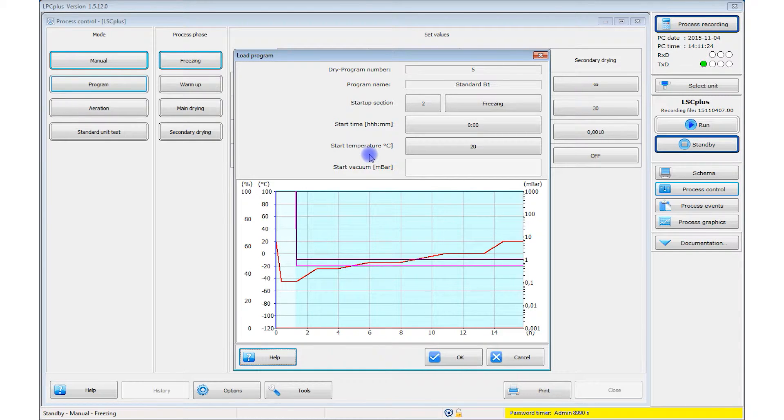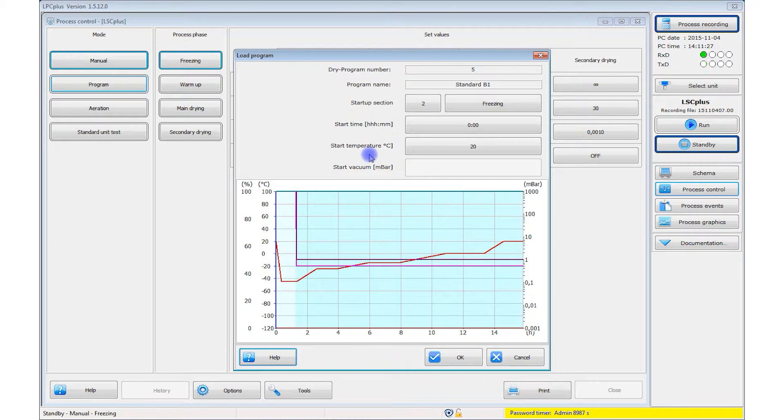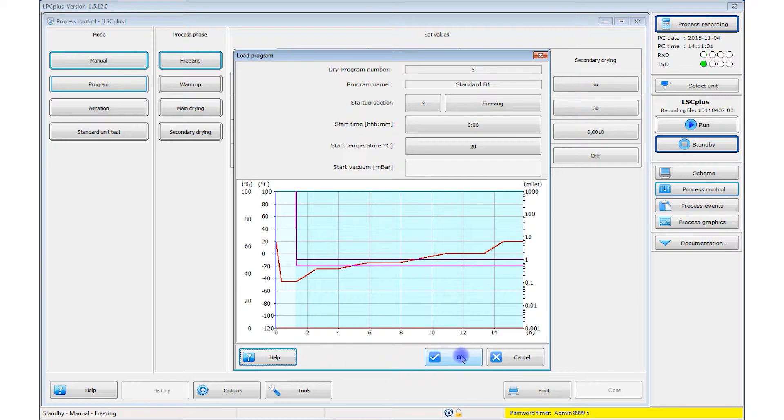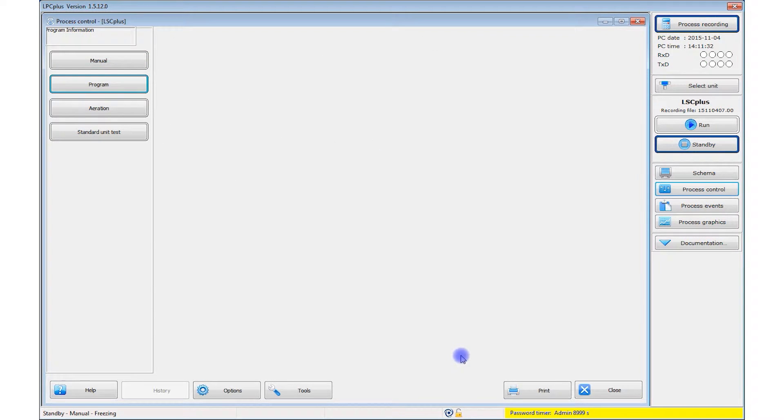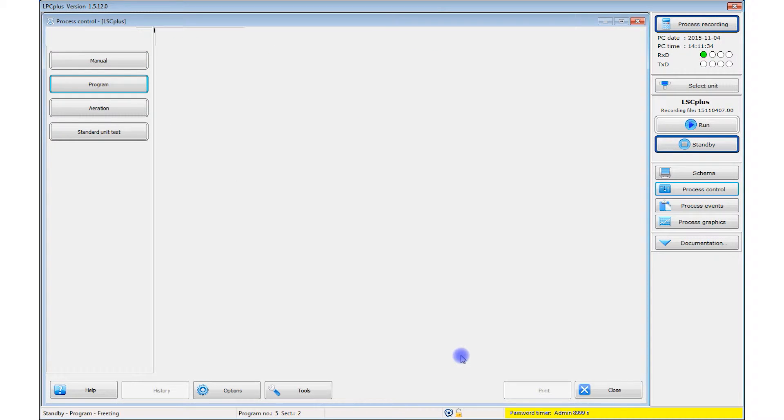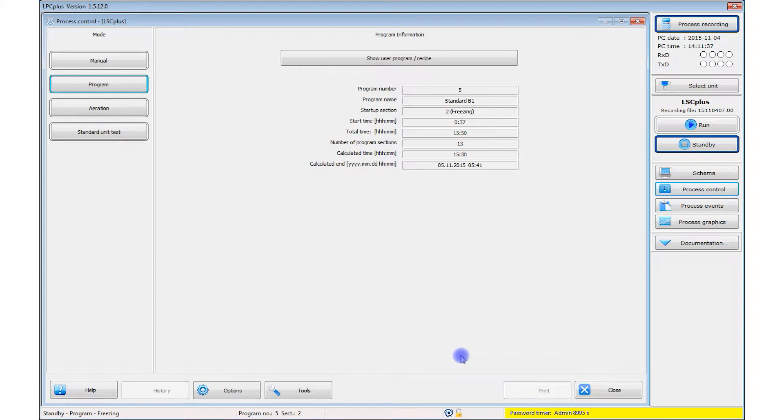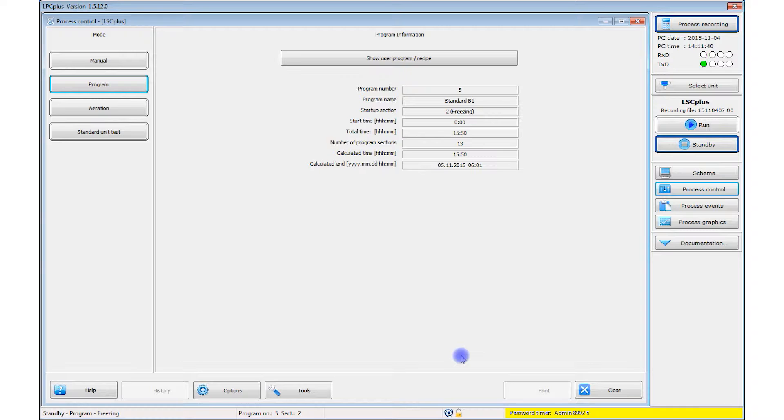You can set a start time for the process or start it immediately. After you confirm your recipe selection with OK, the key data is displayed, such as the total runtime. Now you can start the actual freeze drying.